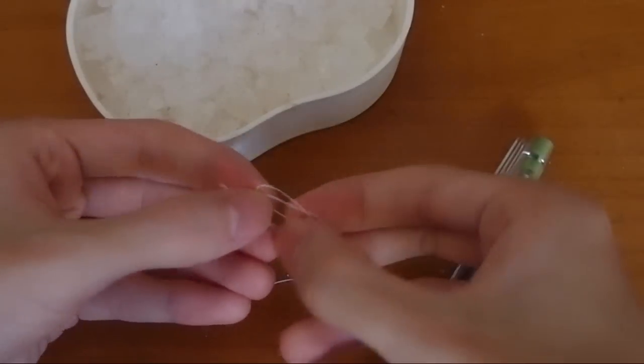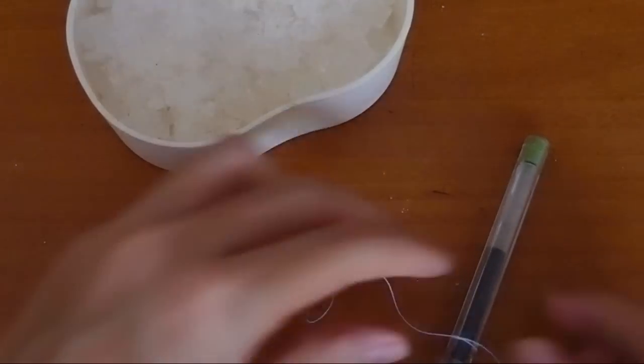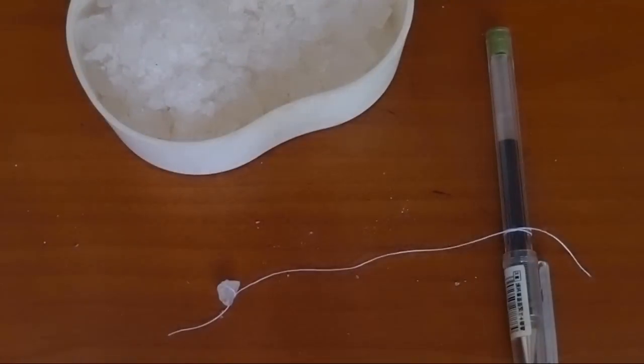Just be patient. We will use it later and now we can just put it aside.